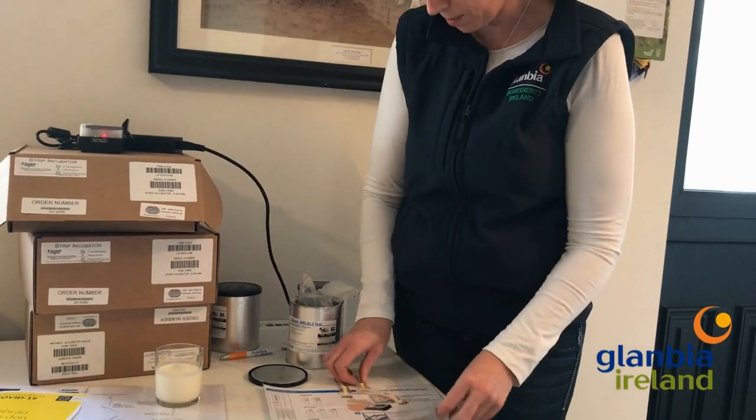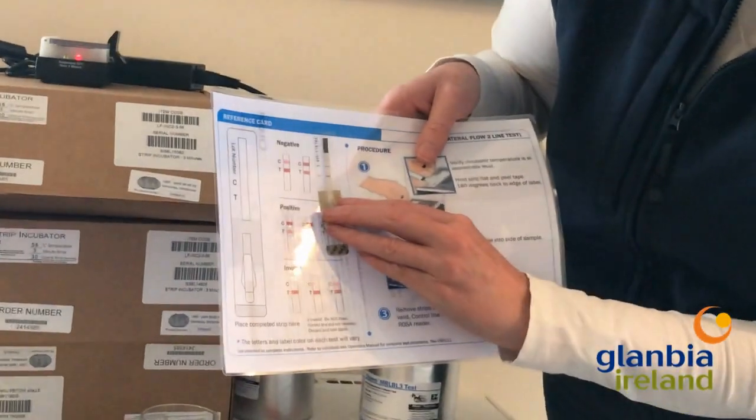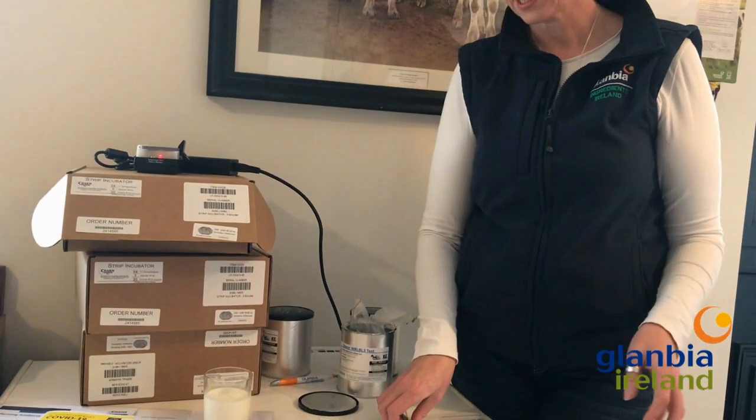Then you just take your strip and compare it to the strip card here, and you'll figure out very quickly whether it's positive or negative. We're there to guide you and help you — give us a ring if there's any problems. You'll have our milk quality managers' numbers and we're there to help. Thank you.